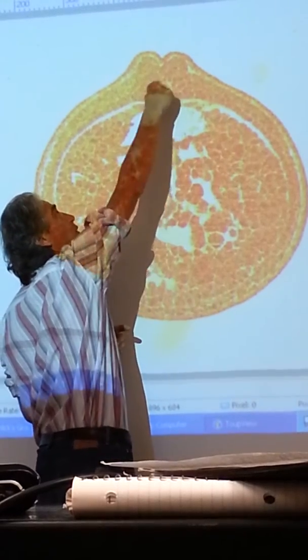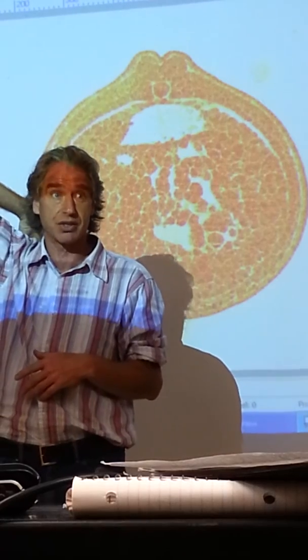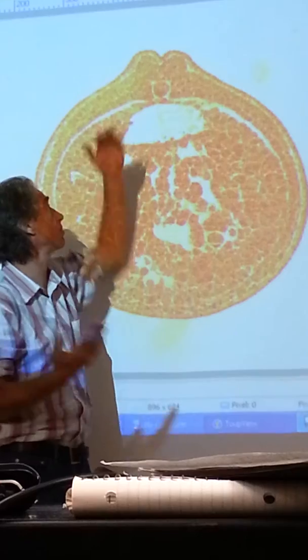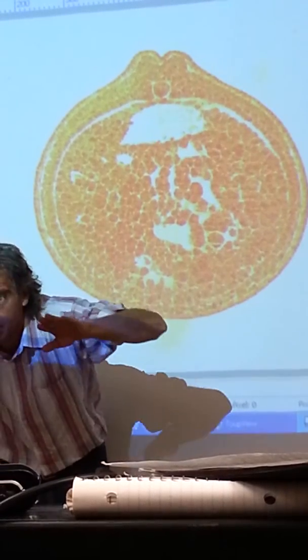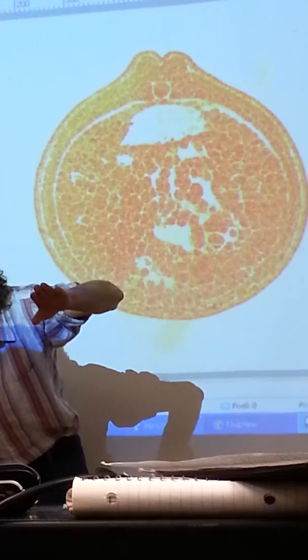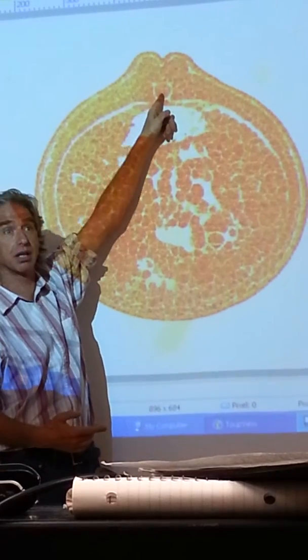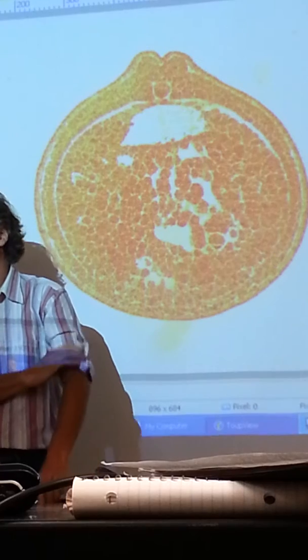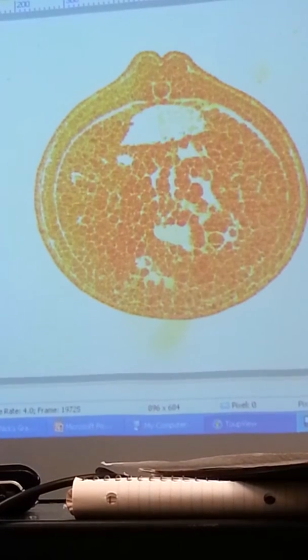Remember, this round thing right here goes all the way down the back of this organism. This is the dorsal side of this organism. This then is the belly side of this organism. And the frog embryo, the little tadpole, is facing toward you, and I've chopped this guy. And so here is his notochord, or what will be the vertebral column of this guy.